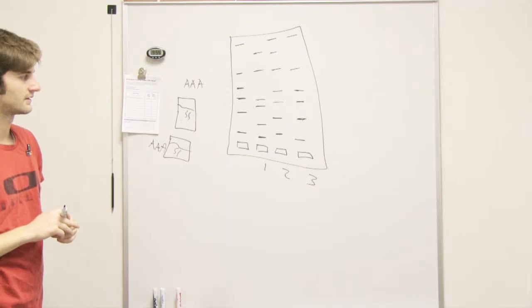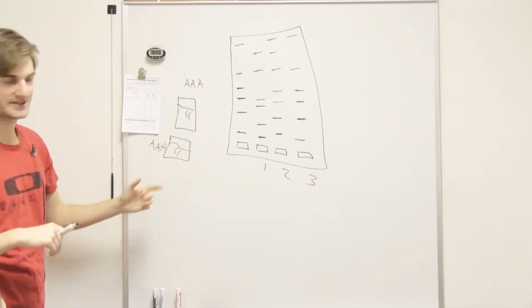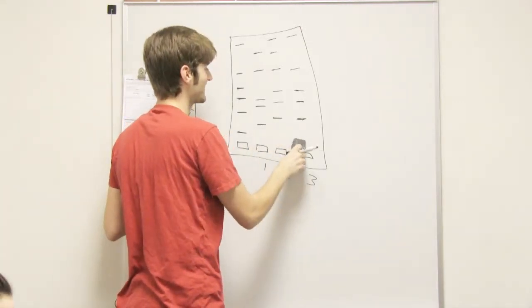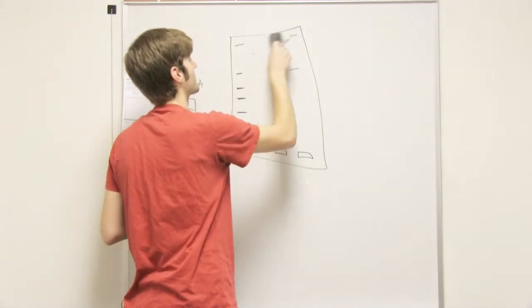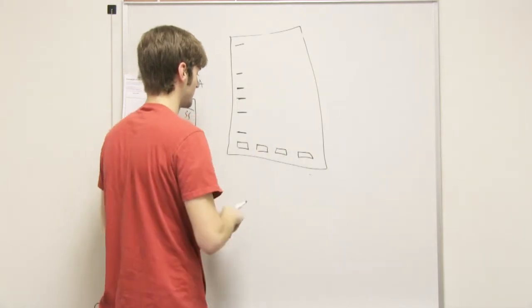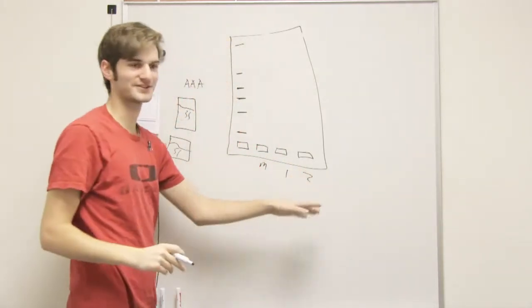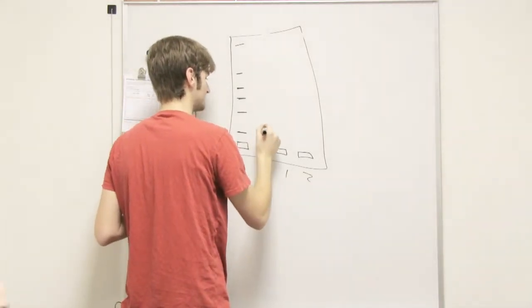So is that still how they do it today? Mm-hmm. They'll still do that, yeah. And paternity tests, you can actually do it this way too. So let's say the first one's the baby. And then we have the mom and dad 1 or 2. We're trying to see who's the father.